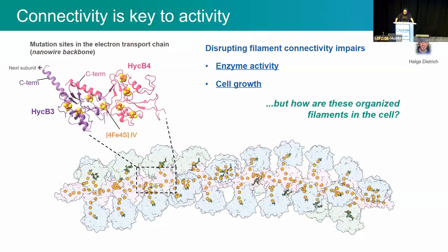However, it wasn't clear how this filament is organized in the cell, or if they are even forming filaments like we saw in the grids, whether this exists in the native cells.